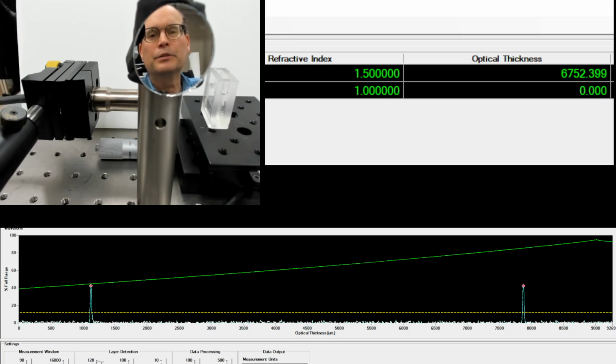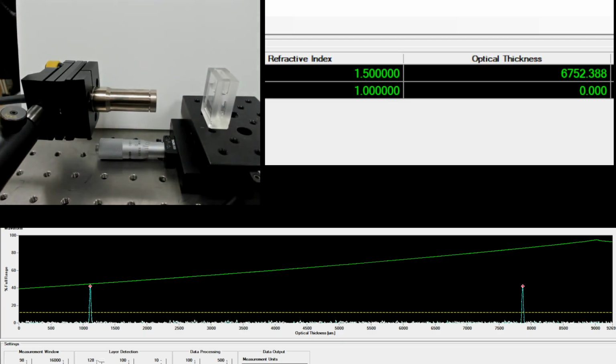Today we are going to measure the changes you see as you add a salt to a liquid. That is something we can measure with the OptiGauge. The setup I have in front of us right now is an OptiGauge Pro pointing at a cuvette. Well, that cuvette has a section where I can put liquids. Right now there's water in this gap here.